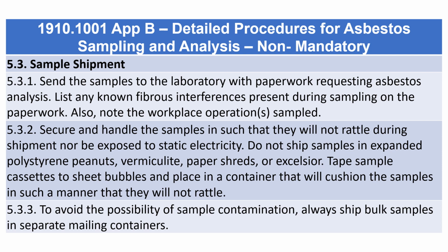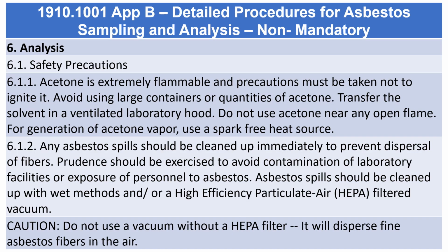5.3.3. To avoid the possibility of sample contamination, always ship bulk samples in separate mailing containers. 6. Analysis.